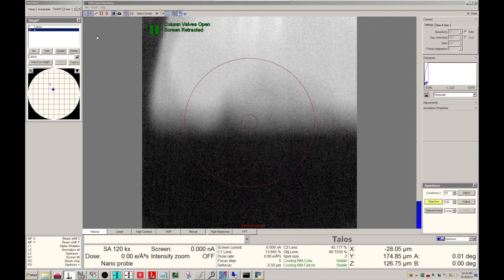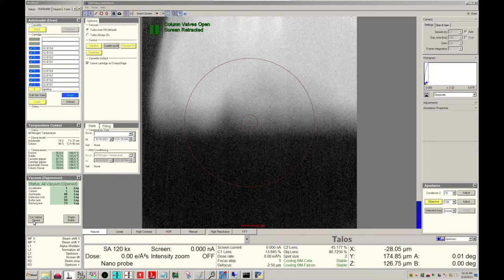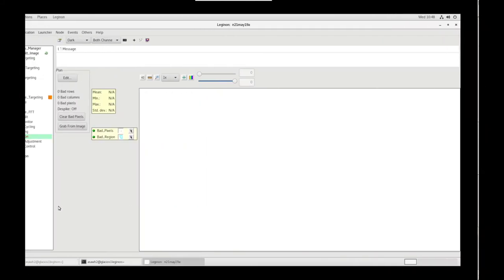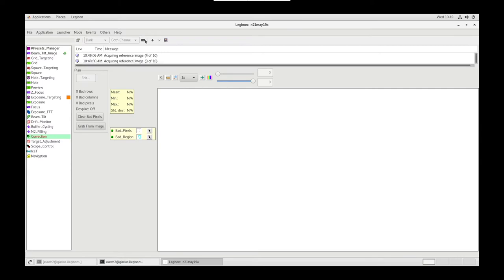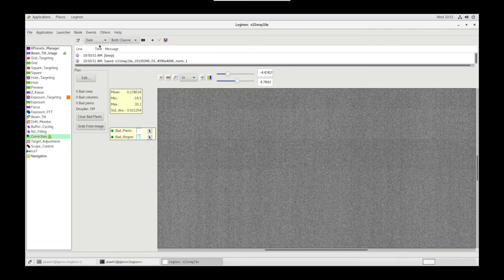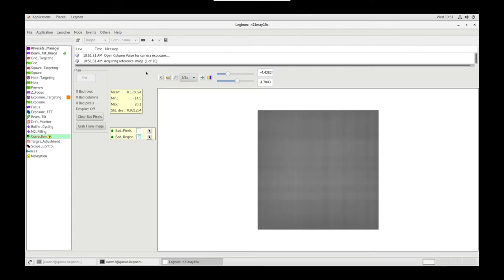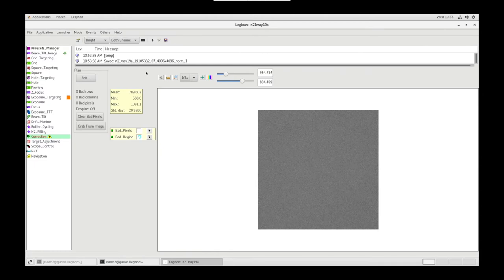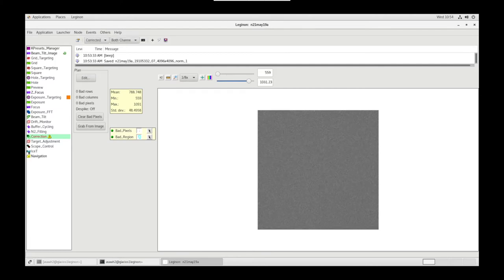Back on the Microscope PC, we'll go to Auto Loader tab and close Column Valves. On Legenon, back in Corrections, we'll go to Dark, Both Channels, and Acquire. Once complete, we'll set it to Bright and Acquire. Column Valves will automatically open. Now let's do Corrected, Both Channels, Acquire. And this is our corrected image.